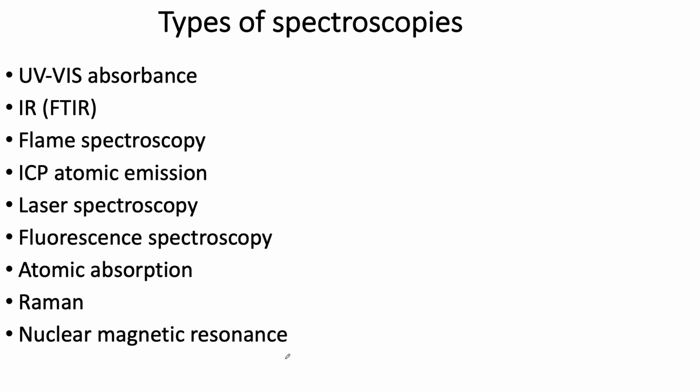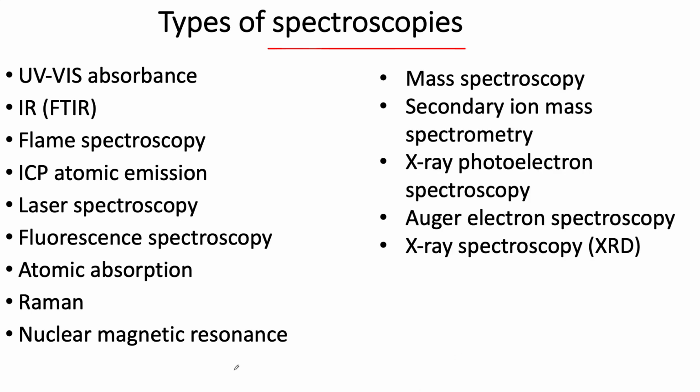So all of these spectroscopies I've listed here are putting light in and then measuring light coming out. All right. Well, except for, I guess, flame and ICP. That's just looking for light coming out. The energy went in in the form of a plasma. There were electrons or something. Things were bumping around, and there was a voltage involved. All right. But there are other spectroscopies, which don't necessarily involve light. They can, but here are some of the others.